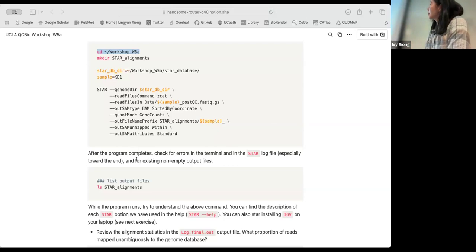Yeah, and there are a couple of other things you can scroll up and down to see, what kind of parameters you can give. Apparently this flag gives you control of how memory efficient you are. And if you're dealing with specific small genomes, you want to make sure that it's done at a fine resolution. And this is just for the indexing. Yeah, it is only for the indexing part.